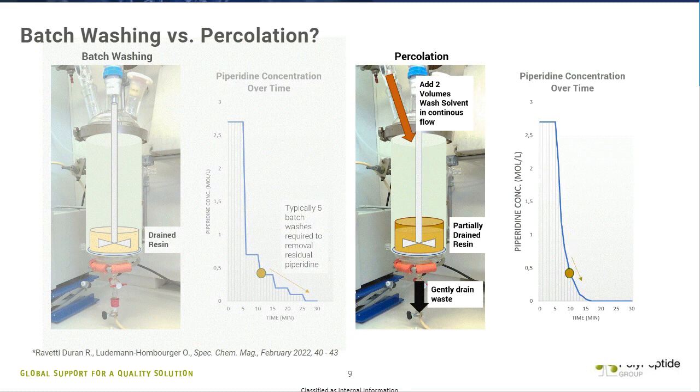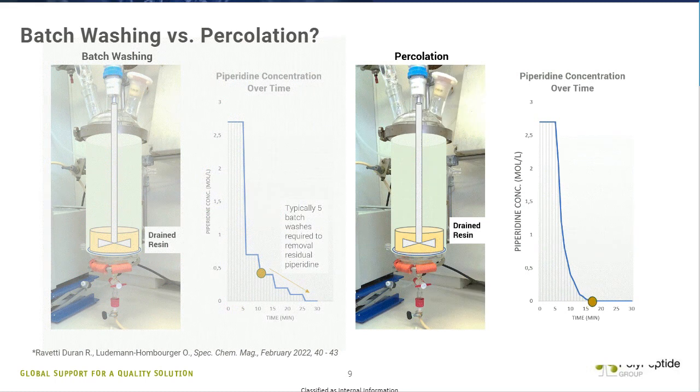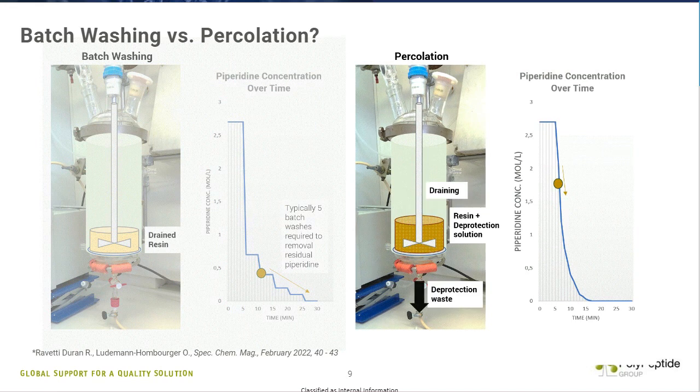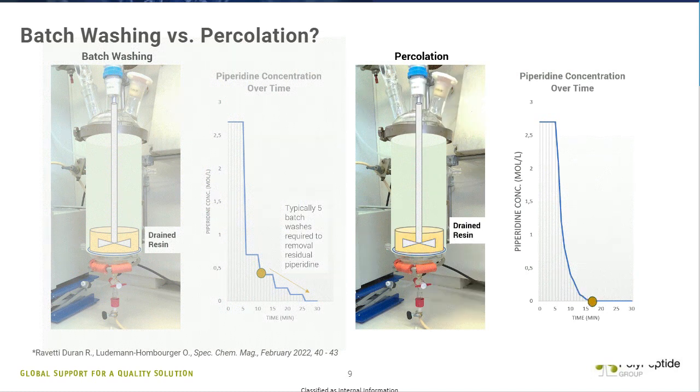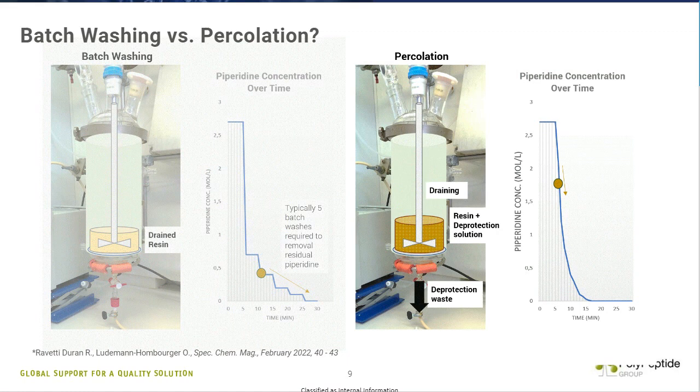Okay. The next question. Just trying to get at whether additional washes are essential after coupling or deprotection to avoid endopeptides? So additional washes. In our case, we think so. We certainly think so after amino acid coupling. In this case, we initially started with, well, it depends, right?